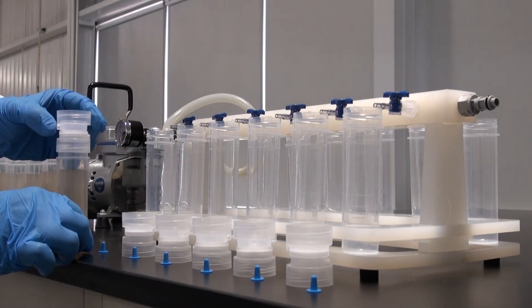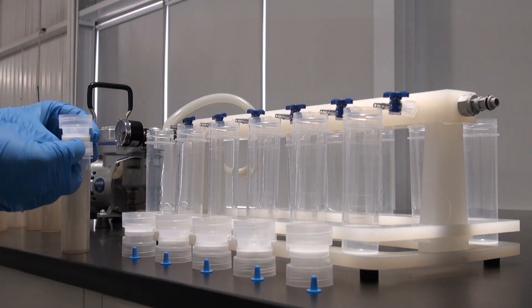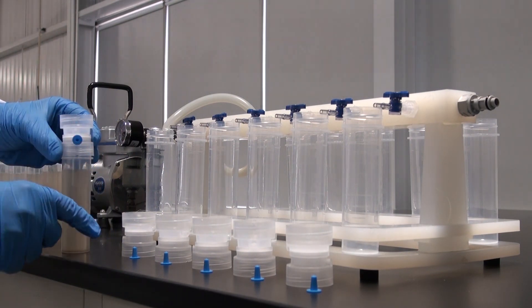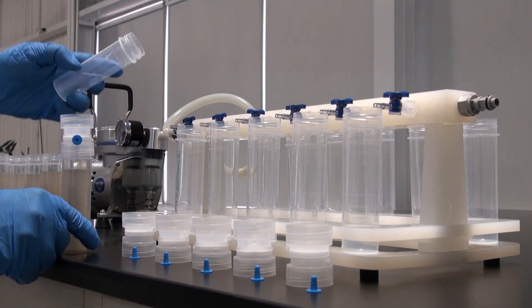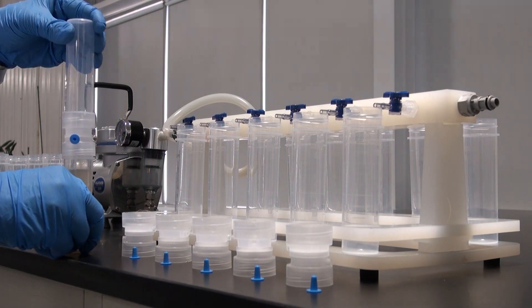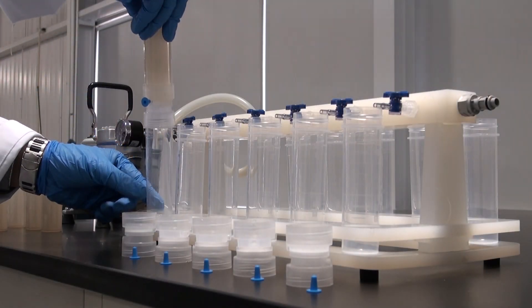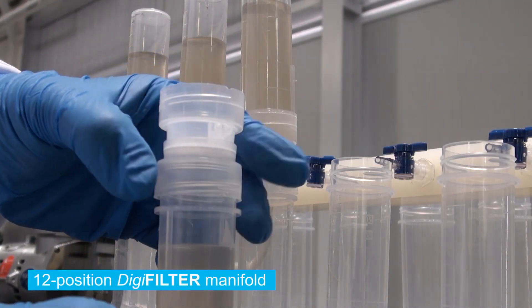Thread the DigiFilter to the digested DigiTube sample and then thread a second DigiTube to the other side of the DigiFilter. Invert and connect the DigiTube DigiFilter assembly to the manifold, in this case a 12-position manifold.